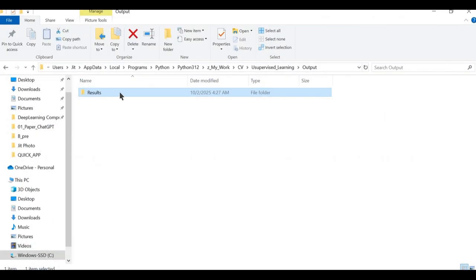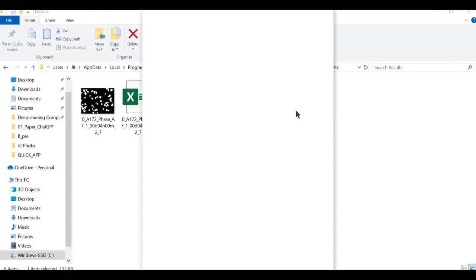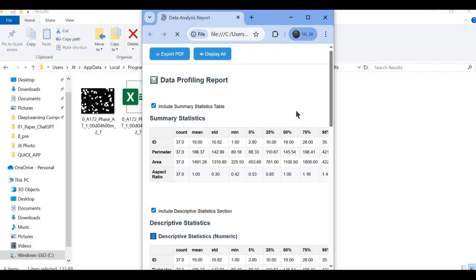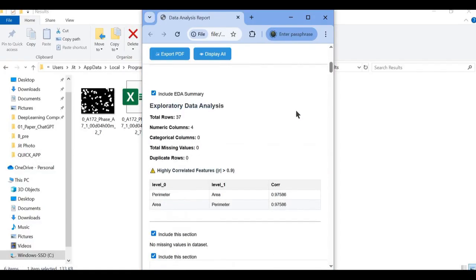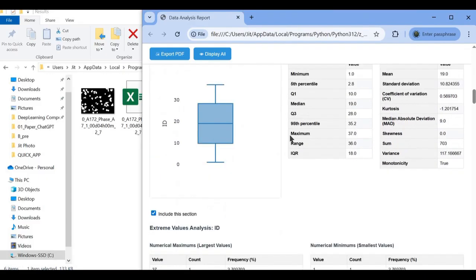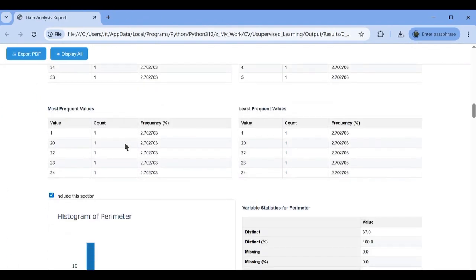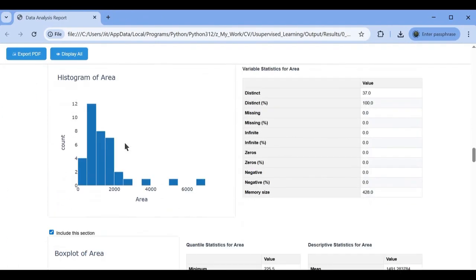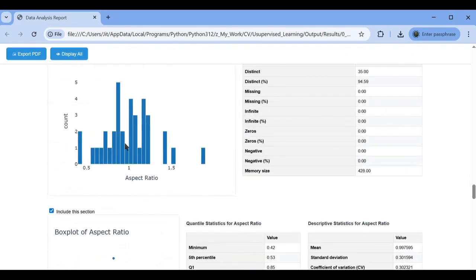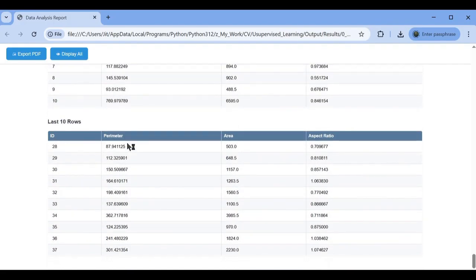This system turns raw data of extracted features into an interactive report which includes descriptive stats, quartiles, univariate distributions like histograms, box plots, and multivariate scatter plots, heat map, etc. It results in an interactive HTML dashboard with toggles for focused review, ensuring rigor in PDF export. As open source, it offers researchers reproducible workflows that speed exploratory data analysis.